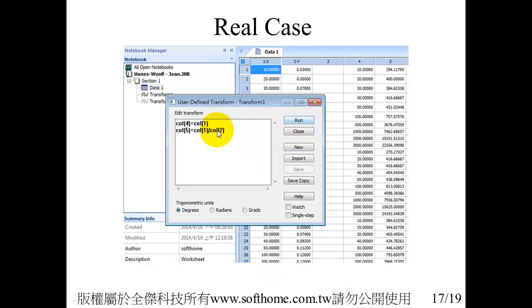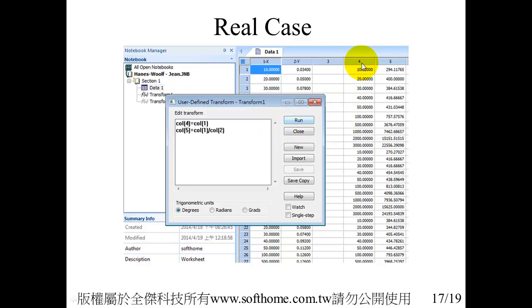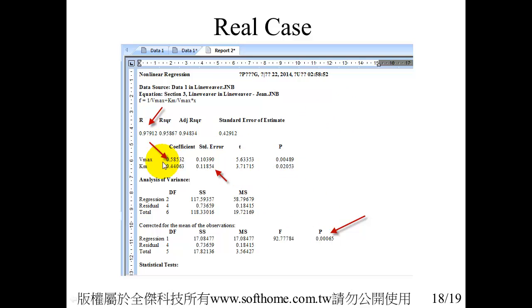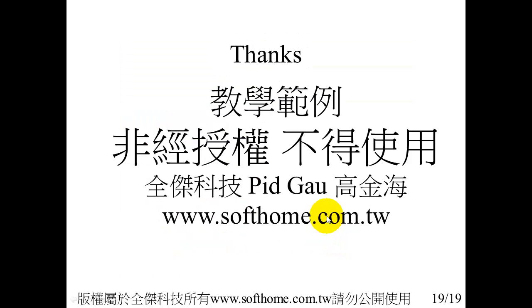Still, you have to transform your data. Now the new data, new X and Y, are put in fourth and fifth column. Use the user-defined linear regression. You can see the R square and Vmax and its standard error, Km and the p-value. Now I will show you how to do this in SigmaPlot.